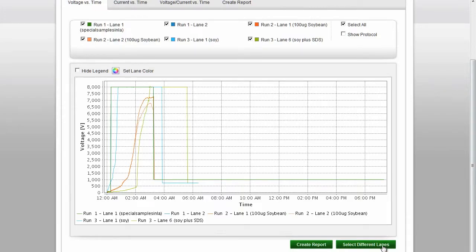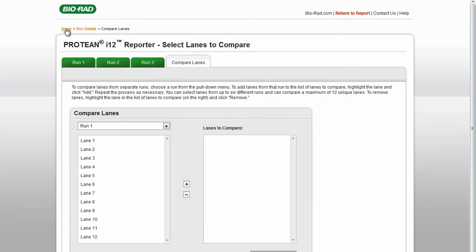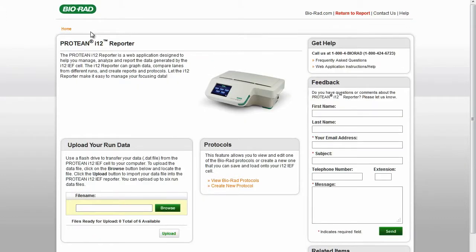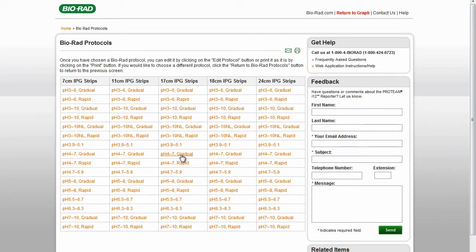Return to the Home screen to view Biorad protocols. All of the protocols for all of the ReadyStrip IPG strip lengths and pH gradients are listed. These are the same Biorad protocols as are programmed into the Protein i12 instrument. Select a protocol if you would like to print it or edit it.